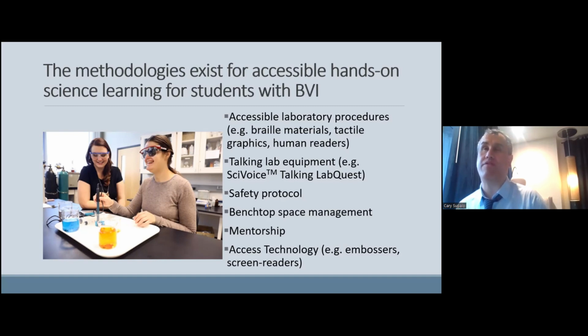This is still important to us because a lot of text-to-speech screen reader tools, I use JAWS every day myself to do my work, but they have difficulty reading chemical expressions. So NaCl, it will read it as "nacl", or potassium hydroxide, KOH, it'll read it as "koh". And so it's not very conducive for high school and undergraduate students to learn chemicals or to do stoichiometry problems when you're reading your chemical symbology as words. So we need to come up with a new way of doing that.